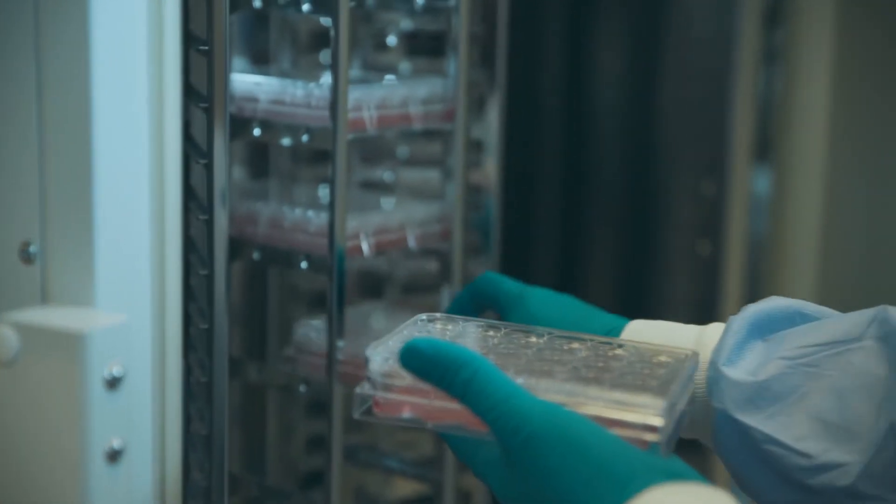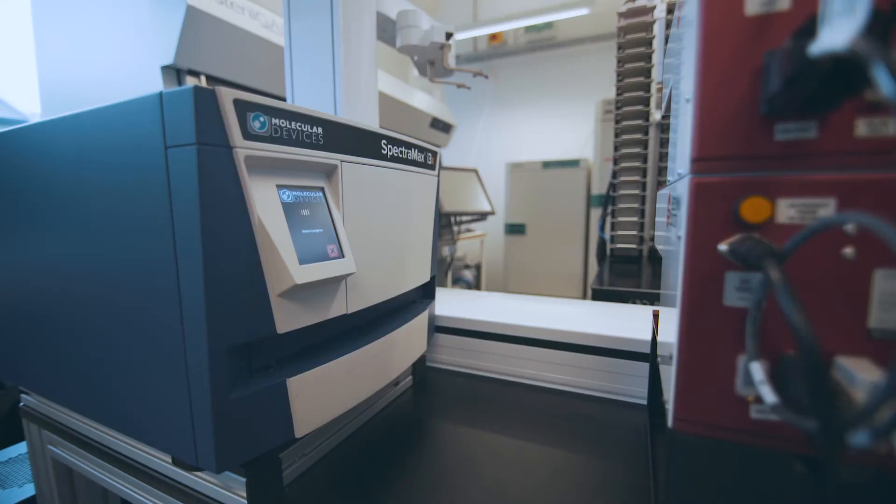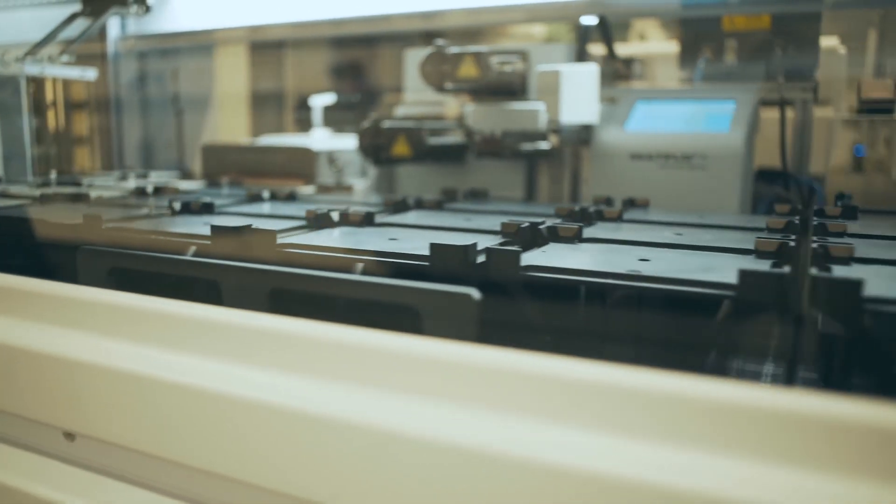Complete workflow automation is achieved by integrating numerous devices such as incubators, hotels, plate readers, plate washers, cell sorters, cell counters and microscopes with the Biomech.